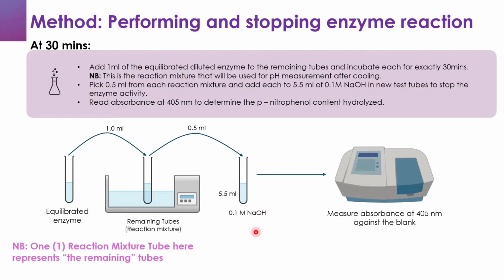So once we stop the reaction at 30 minutes by pipetting 0.5 ml of the reaction mixture and adding it to the 5.5 ml of our 0.1 molar sodium hydroxide, we measure the absorbance at 405 nanometers against the blank prepared at 0 minutes.